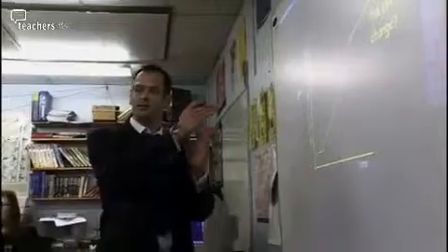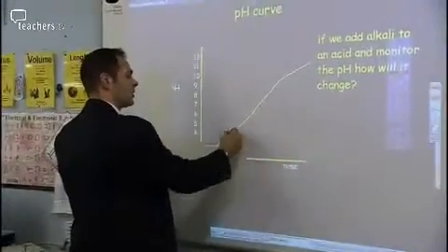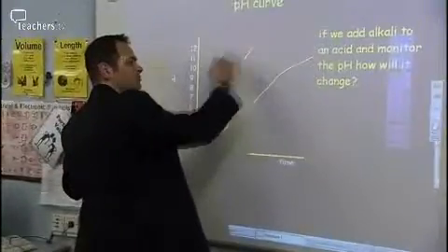Right. Yes, Dom? Would it neutralise faster as it got more neutral? Because it doesn't have as much acid to react against. Good idea. So you think it might actually be a bit steeper? More like a curve. Yeah, but so that it's continuous. So it's continuous. Right. Okay.